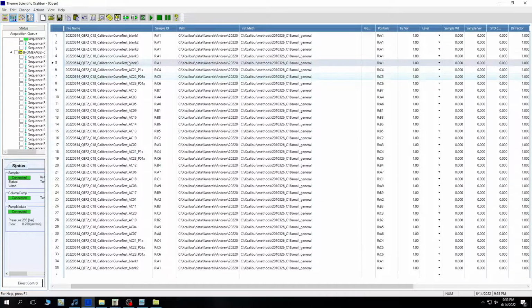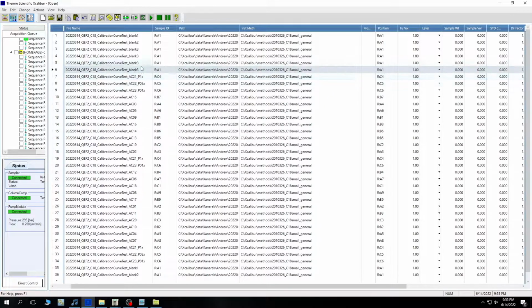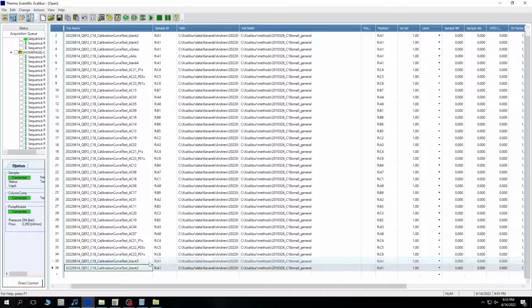If you don't have enough liquid for all 3 to be injected, generally O3X is the least important. But you want to make sure you have at least 1 of O3X.